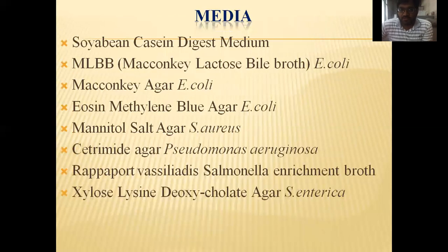Media. You can see there are so many media listed, starting from soybean casein digest medium, which is a simple medium like nutrient medium, nutrient broth, and MLBB, MacConkey lactose bile broth for the E.